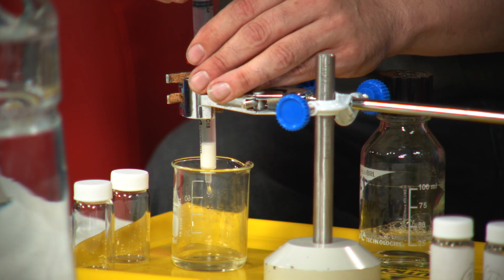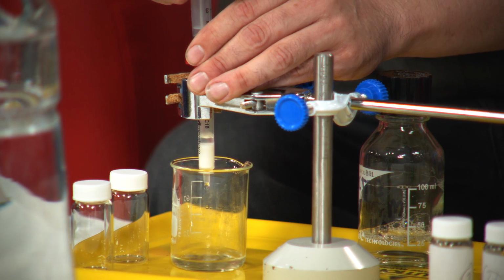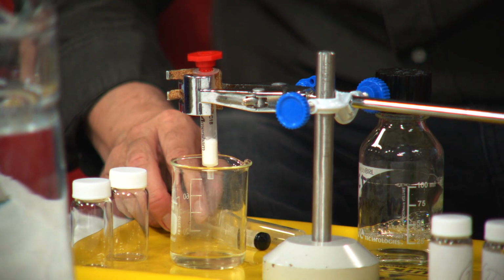Don't know whether you've got a close up of this. Yeah, we can see relatively close, but not in too much detail. So just push that through. So that's the first two. That's now the column prepared. And now what I can do is add the food colouring.